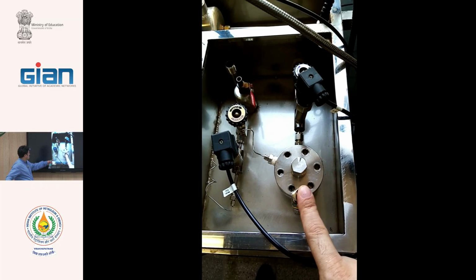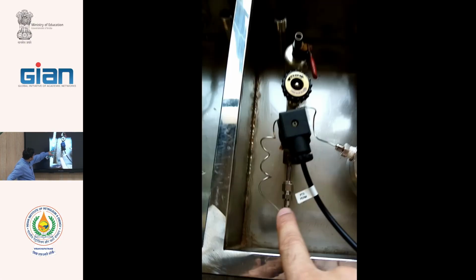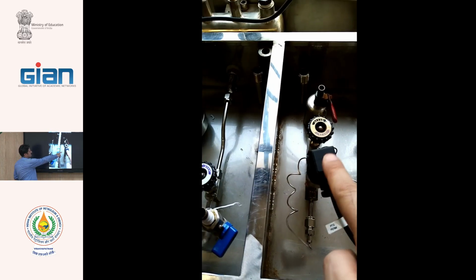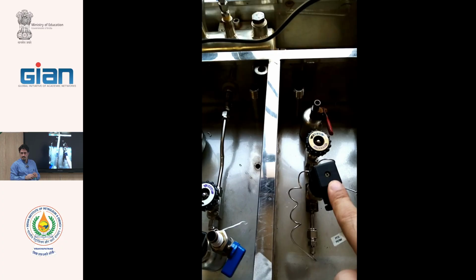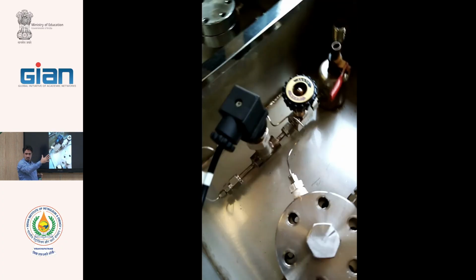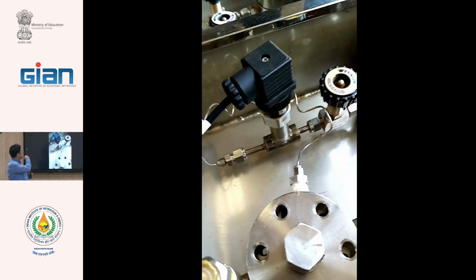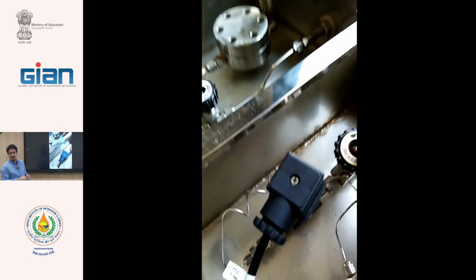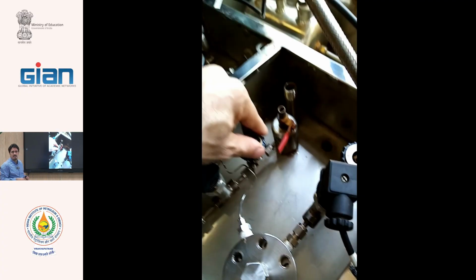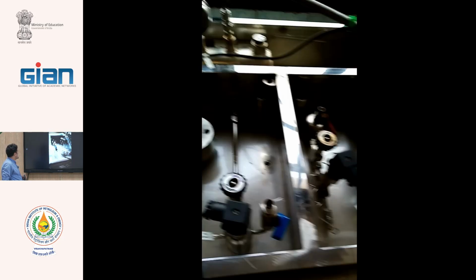This is the cell, and this is for vacuum. This is the permeate side. The permeate comes here. We have a very small tank here and measure that. This is a very sensitive pressure transmitter. If during the test we have, for example, 5 atmospheres here, and the membrane tears or is poor, this transmitter will be destroyed. Therefore, the membrane should have very good stability. Without stability, this very sensitive sensor will be destroyed.